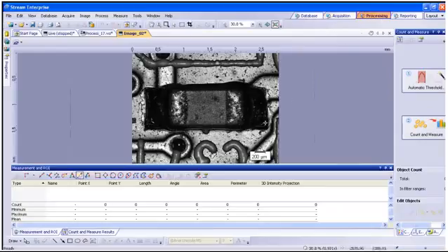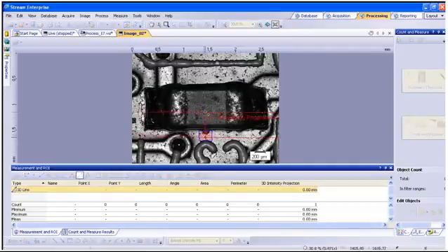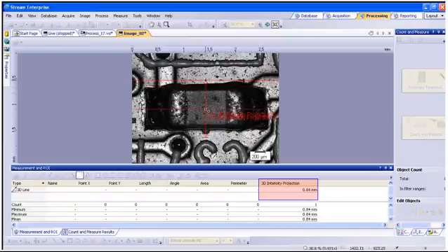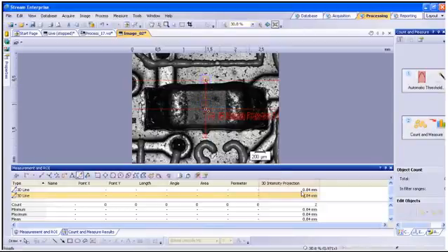You will need to select the Processing tab. Within the Measurement and Region of Interest tool window, select 3D Line Measurement mode. Place your first mark on the image, then place the second ending mark. This now shows the 3D intensity projection between the two height points selected. We can now also select a point for measurement on the opposite side of the sample. This second point shows the same height measurement on both sides of the sample as expected.